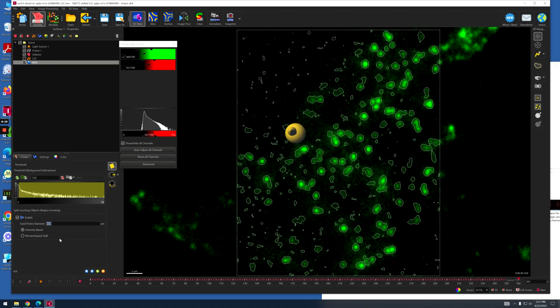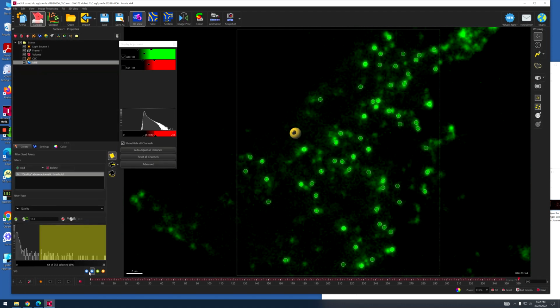The surface would enlarge if the background is still, well, I don't know how to explain this better, but the number that I set is 0.4 micrometer in the paper. And intensity based. Yep. And now next step.